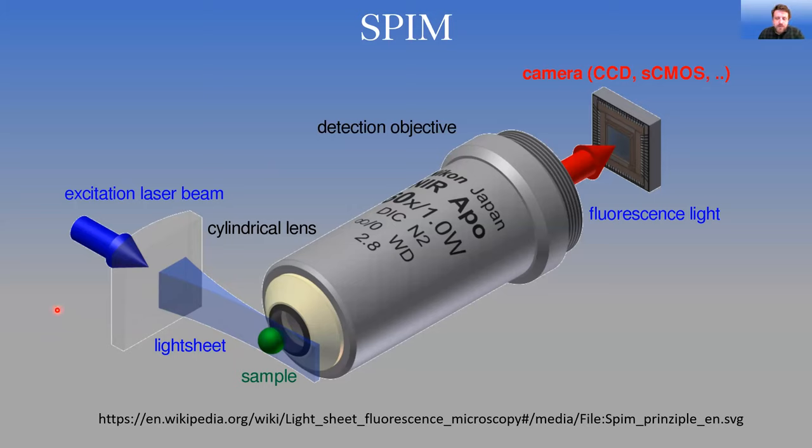in terms of frames. And the other large benefit you get is that you're not illuminating out of the focal plane like you would with a confocal. So the benefit there is that you don't get out-of-focal-plane bleaching. That gives you really reduced photobleaching or phototoxicity for live samples, and can work as fast as your camera can read. So it combines speed and sensitivity all in one. There are multiple different ways of forming these sheets, and I'm going to talk a little bit about the unique features of the system that we have.